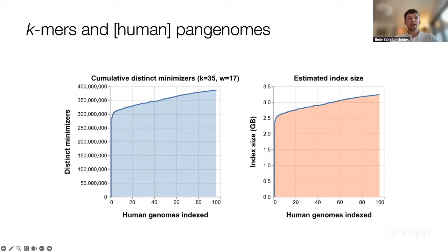You can add together the k-mers from 100 human genomes, and they're only marginally heavier than a single human genome. And that's because you only need to store the parts that are different. Conceptually, this is superior in that we can succinctly represent potentially all of the reference quality human genomes ever sequenced to boost our ability to classify human sequences equitably across different human ancestries.